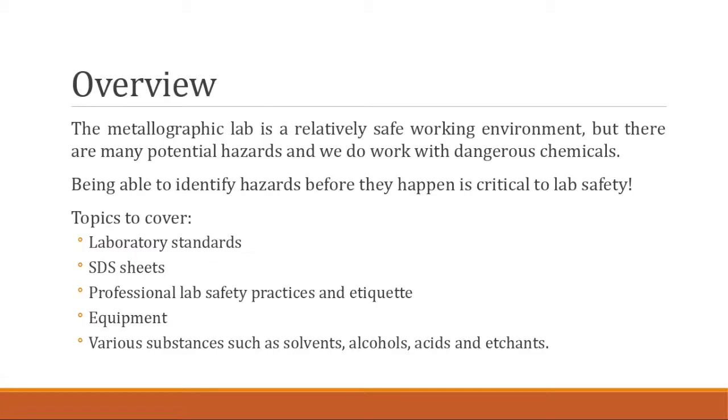So to give you a quick overview, all metallographic labs are relatively safe environments, but with a lack of discipline or experience in a lab, you can run into many potential hazards if you become too complacent. Something like, I don't need to work on this too much, or it's not going to hurt me, and then all of a sudden that's the time that an accident happens.